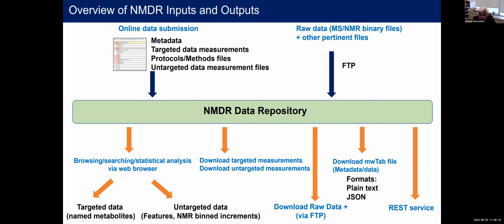This is a data repository. We allow browsing and searching, statistical analysis, downloading targeted measurements, downloading MWTab files at various levels, and so forth. I'll walk you through this in a minute.